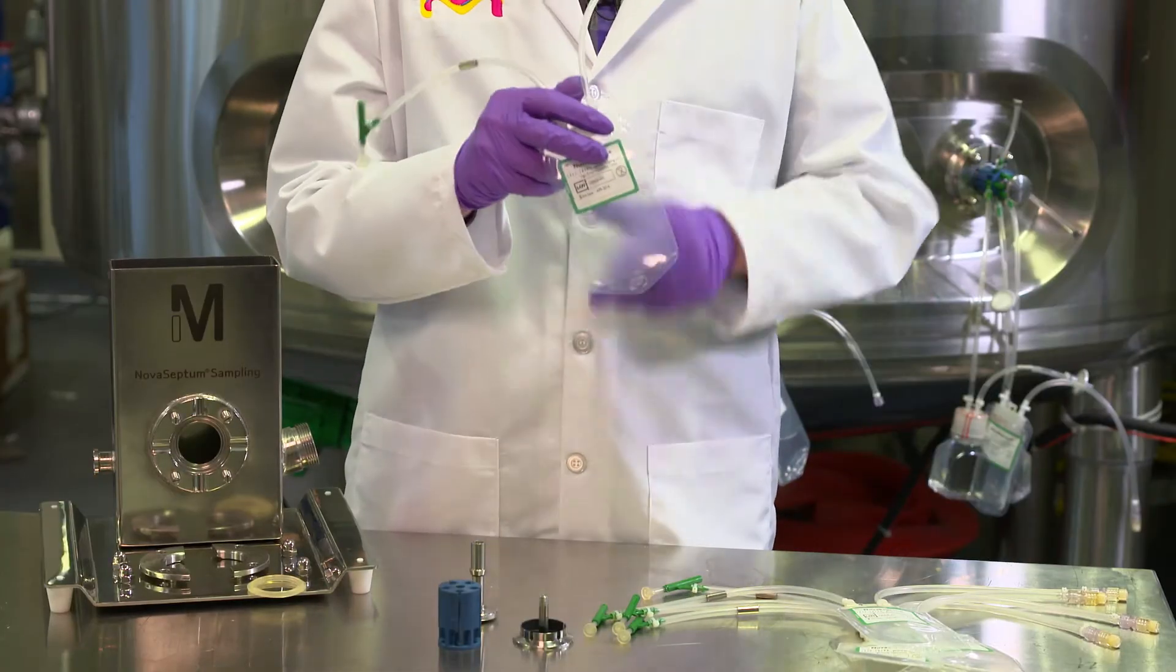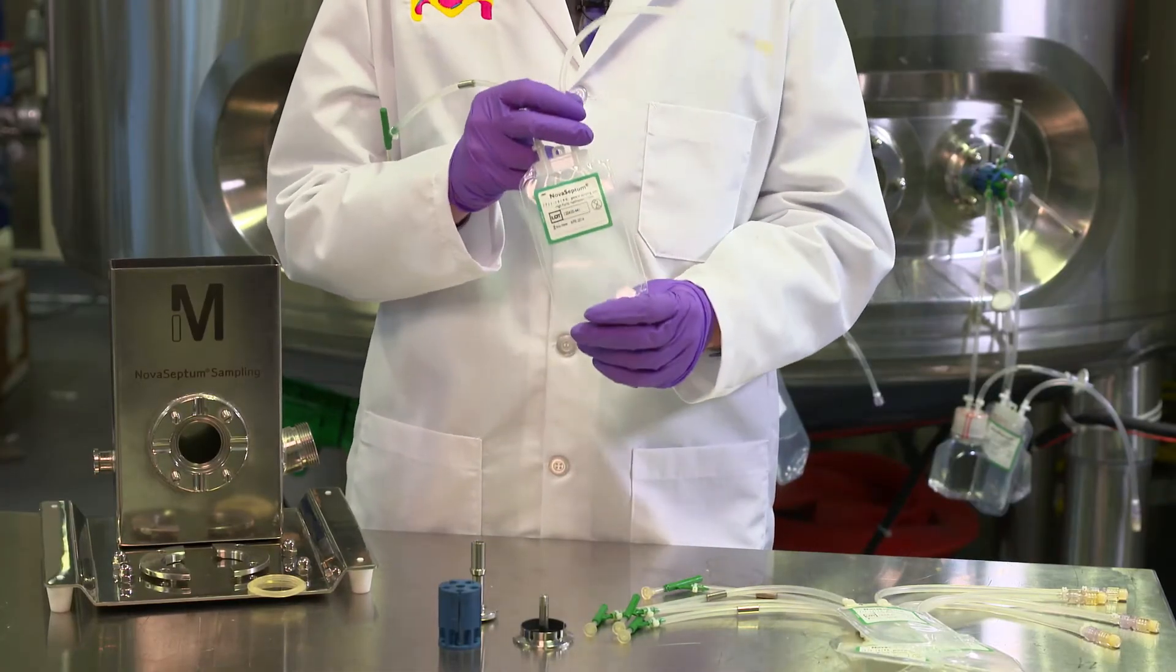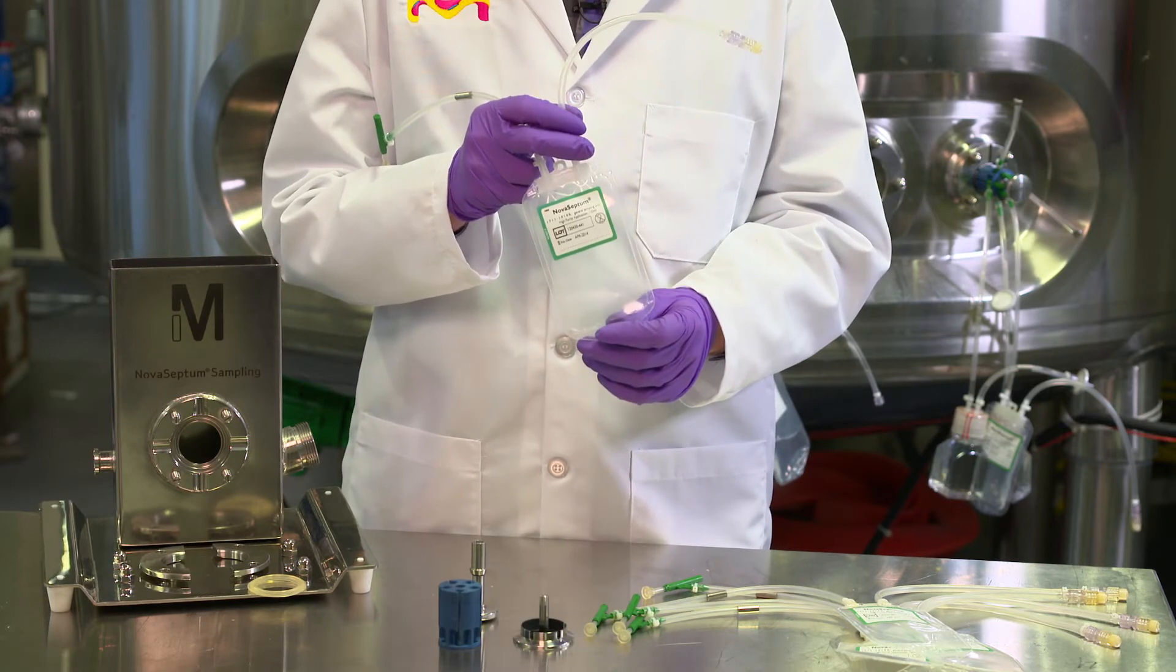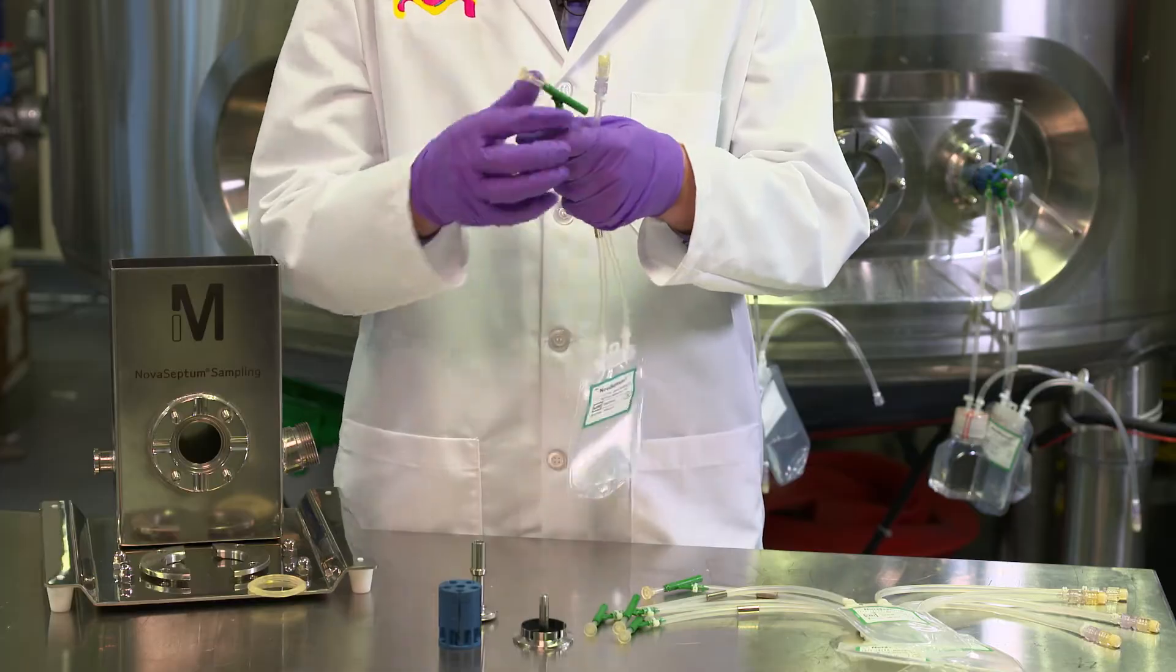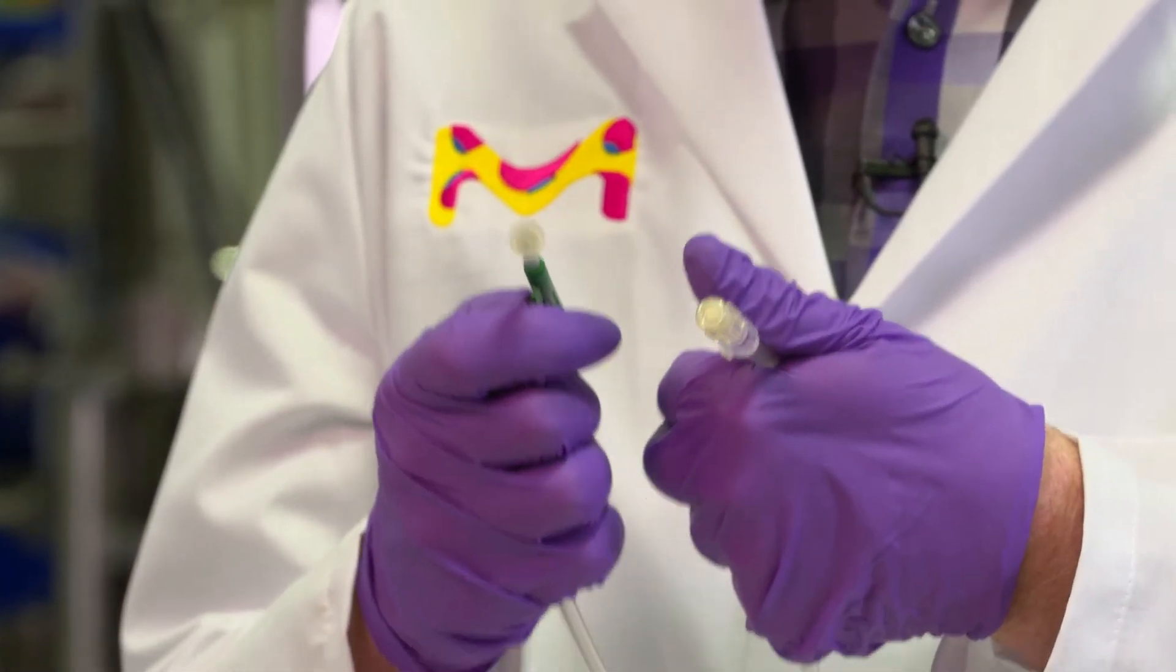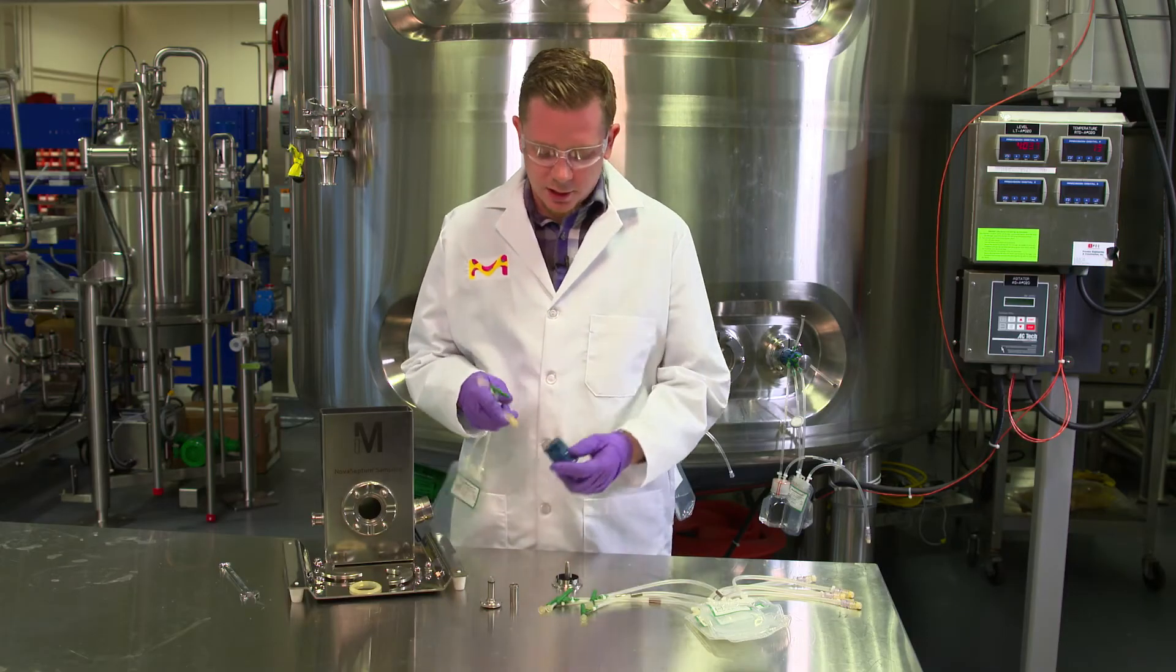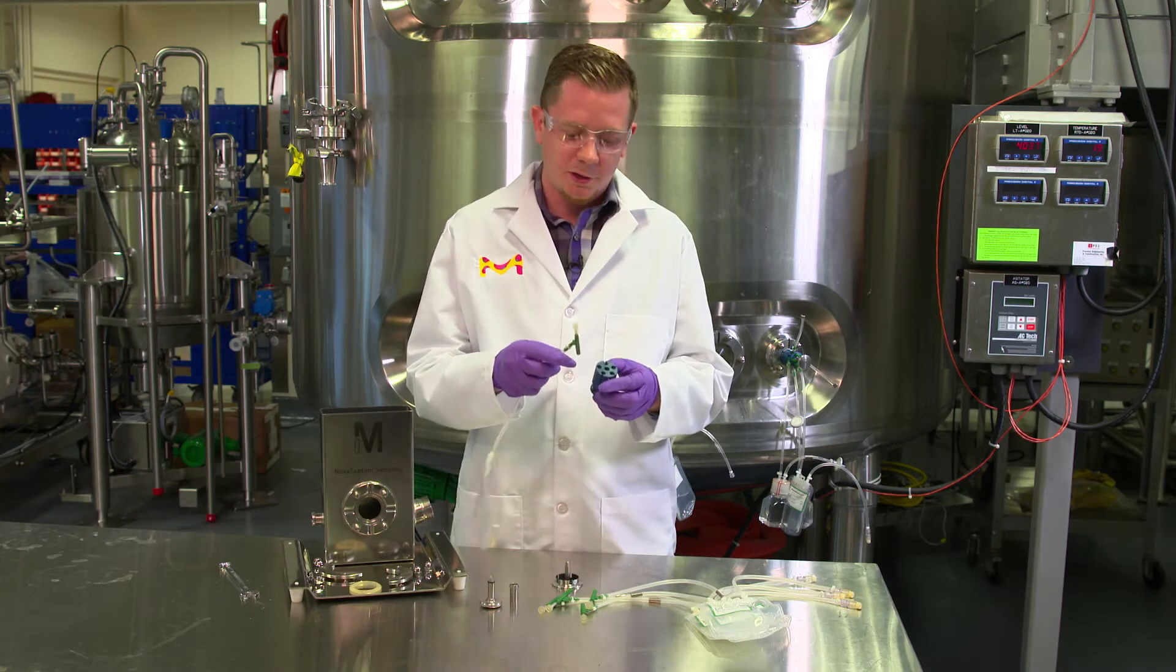The next step is to take our container, which is a closed, sterile container. It's sterile from being gamma irradiated, and it's closed on each end so that we maintain sterility. Each of the containers gets loaded up into the holder like so.